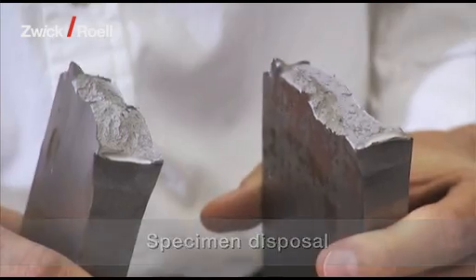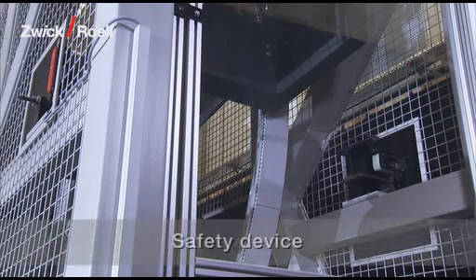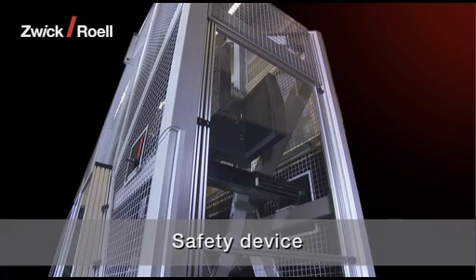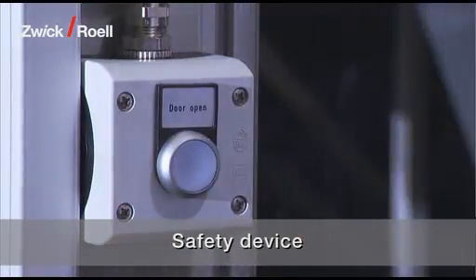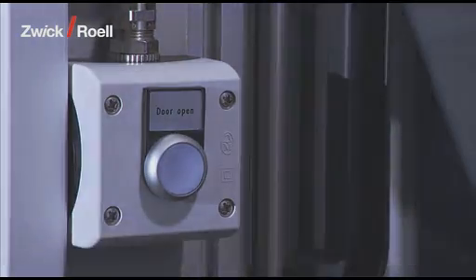The access door features electrical and mechanical interlocking and monitoring, ensuring that the system conforms to the highest safety standards.